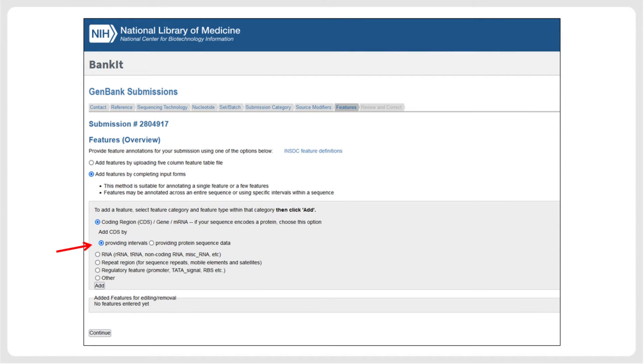As a final step in BankIt, the sequence features need to be specified. In our example, the submission consists of intronless coding sequences only, and in this case, the feature is easiest to specify using the Intervals option.